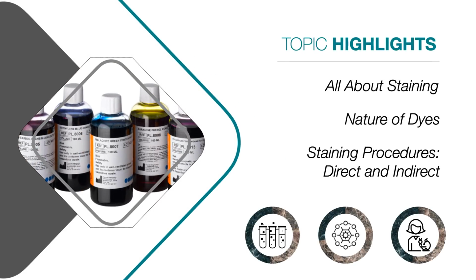For today's topic, we'll be talking about the staining itself, the nature of the dyes and the procedures, the meat of this topic, the different procedures that we will have to master so we can better identify our bacteria. So, let us start.